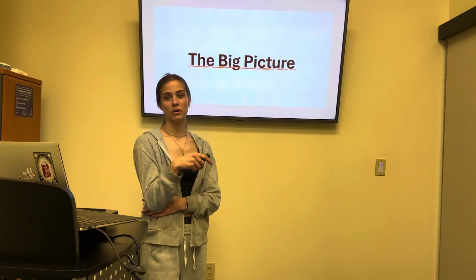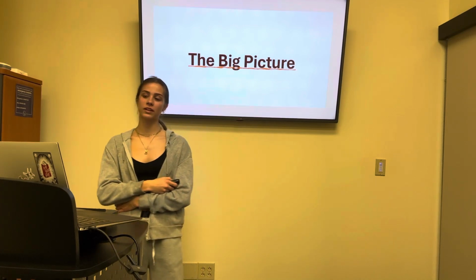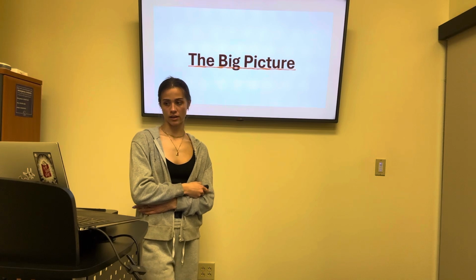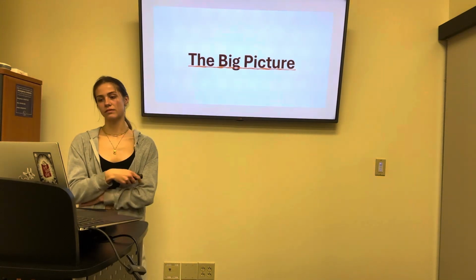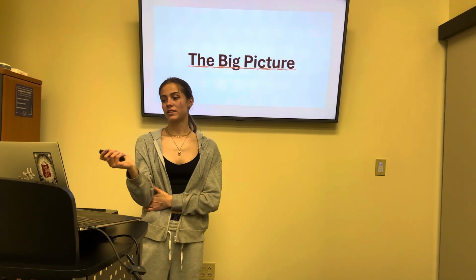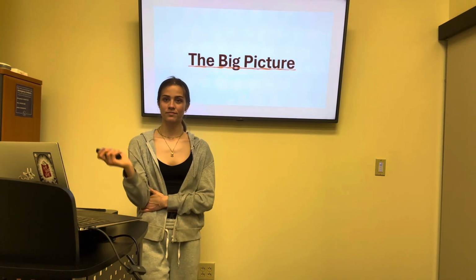So to summarize, the goal of this experiment was to identify the unknown contaminants present in the 3 contaminated water samples using NMR and IR spectra. The presence of these molecules in drinking water would pose serious health risks, as evidenced by this discussion for both humans and the environment.